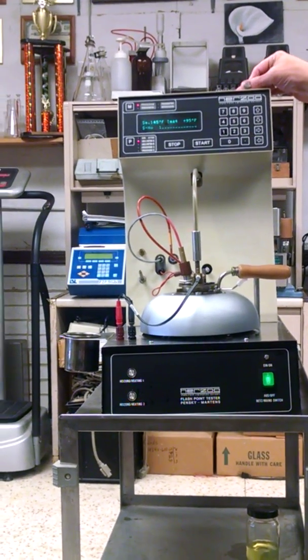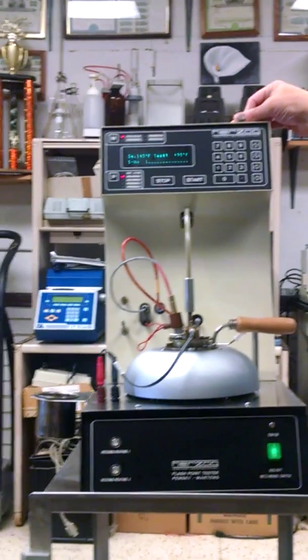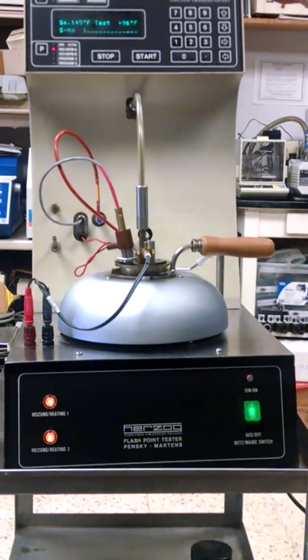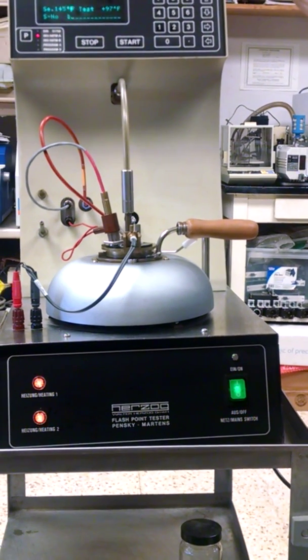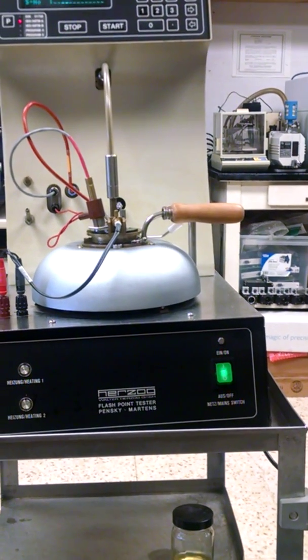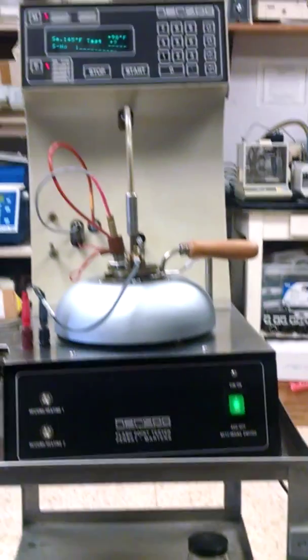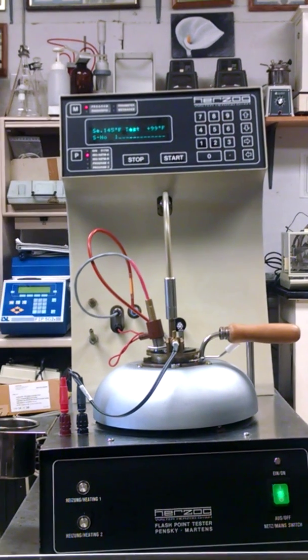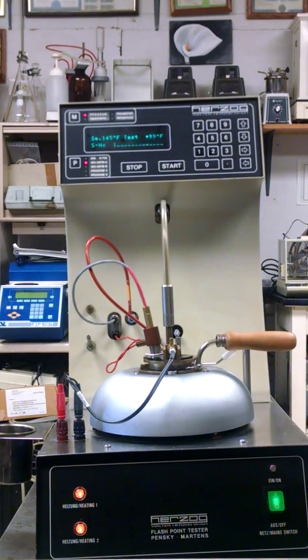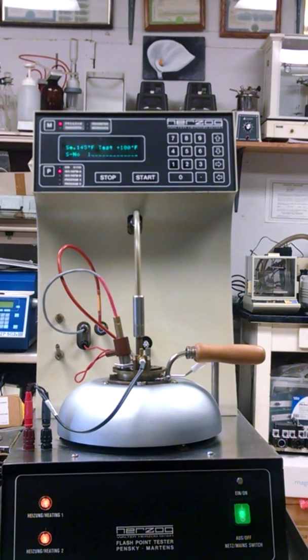Now Herzog was purchased by PAC so they're no longer in business. PAC I think still sells some parts, not a lot. I know they still sell the probes for this machine, but you know for the price that you're paying for it, you put it on your bench and you run ten flashes a day, in a year's time it's paid for itself. Plus you've got a lot of extra profit. I can't say that about a brand new machine. You put it on the bench and you're going to have to run a whole lot of flashes to pay for it.